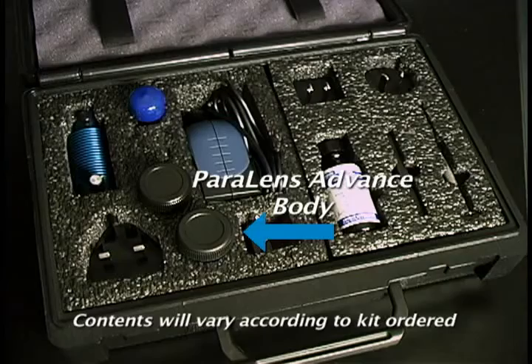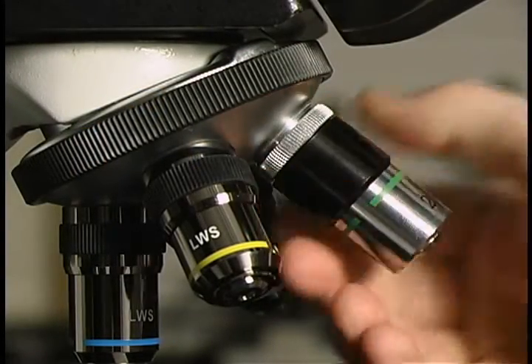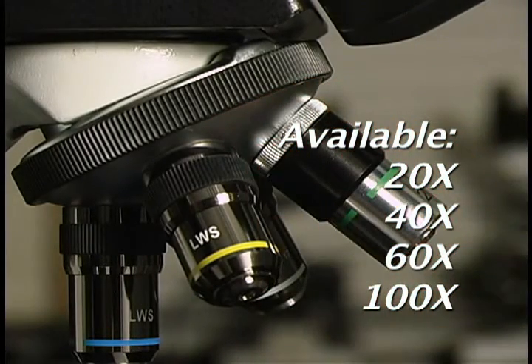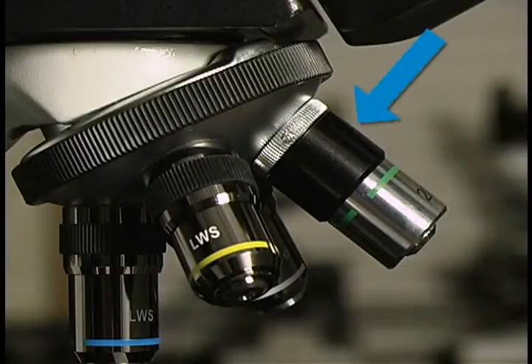The Paralyns Advance body attaches directly to the microscope nosepiece by way of standardized RMS threading. Objective lenses, available in 20, 40, 60, and 100 times magnification, are threaded into the base of the Paralyns Advance body. Adapter rings are available for microscopes which do not have RMS threading.